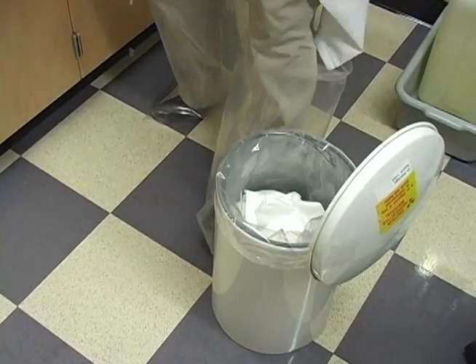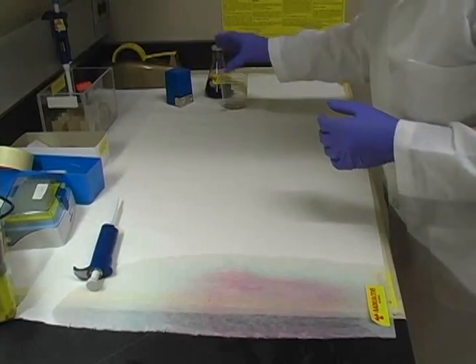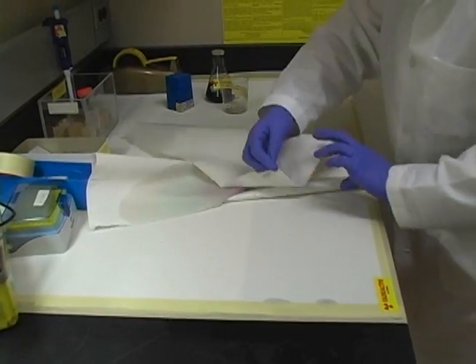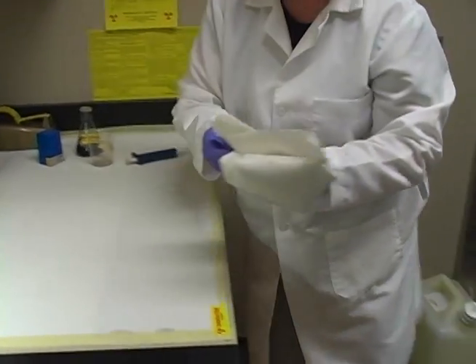Then we put all that soaked-up liquid and paper towels into a combustible radioactive waste container or plastic bag that we're going to label as combustible radioactive waste later. Take up the absorbent paper that got contaminated and put that in the combustible waste as well.